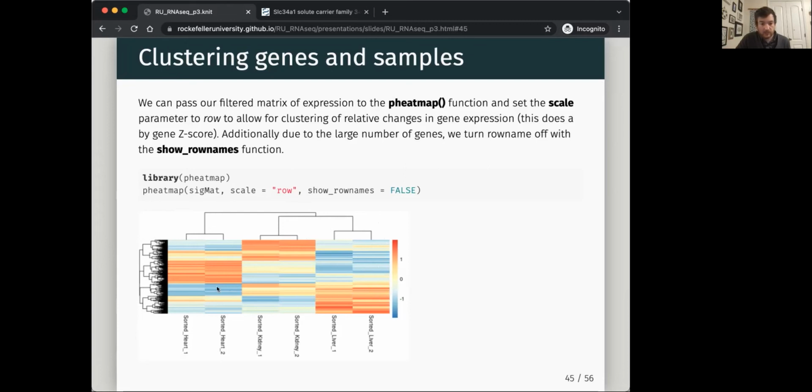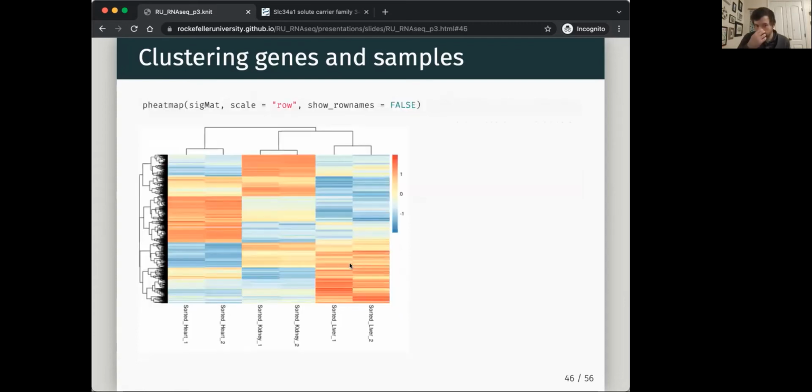And so you can start to break these down by just looking at them. If I just visualize these, I can make a guess at how many clusters look sensible, right? I could say there's one here, maybe there's another one here, maybe another one here. And you can start to get an idea of how many clusters and how many patterns seem sensible. Okay, and here's just a zoom in.